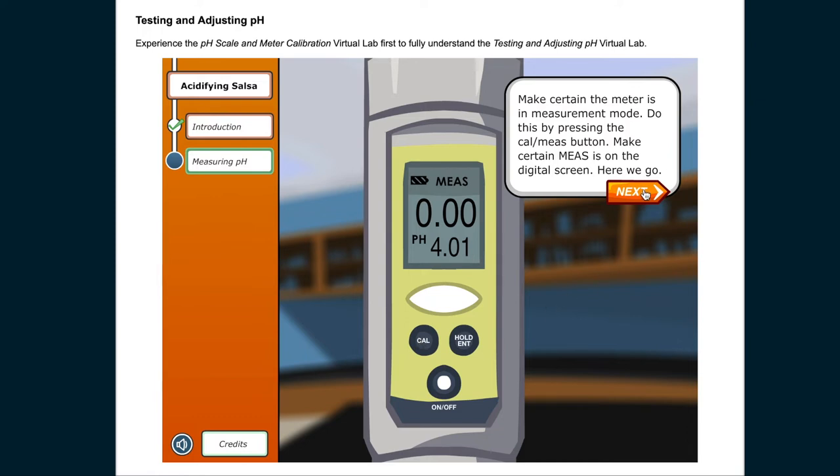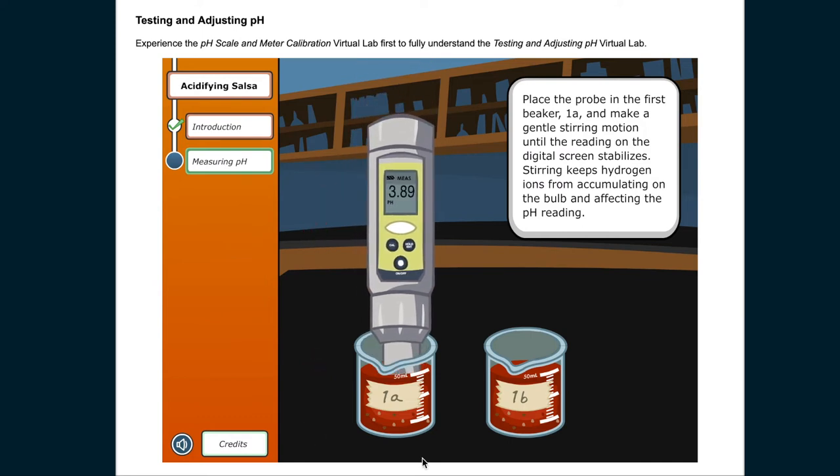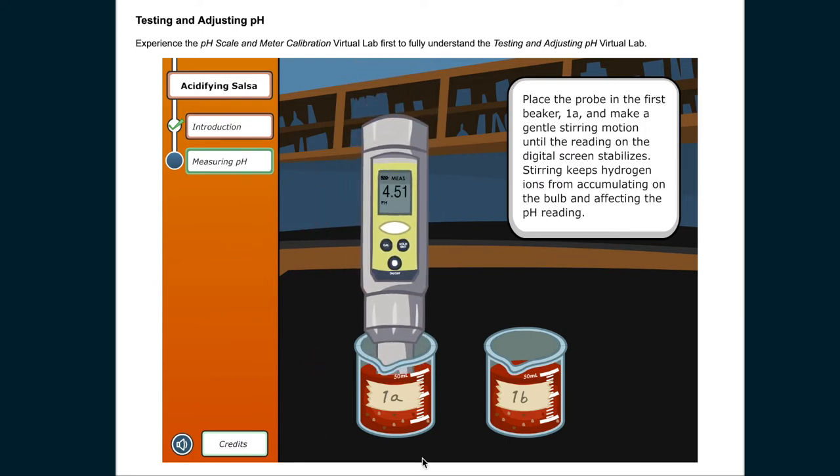Here we go. Place the probe in the first beaker, 1A, and make a gentle stirring motion until the reading on the digital screen stabilizes. Stirring keeps hydrogen ions from accumulating on the bulb and affecting the pH reading.